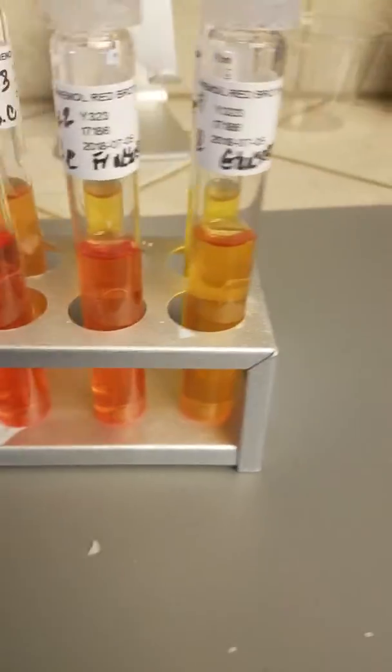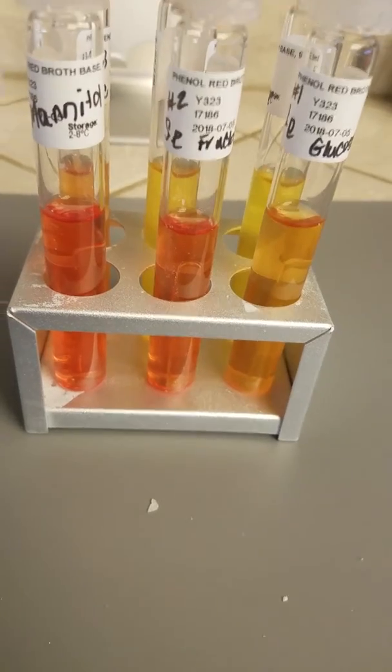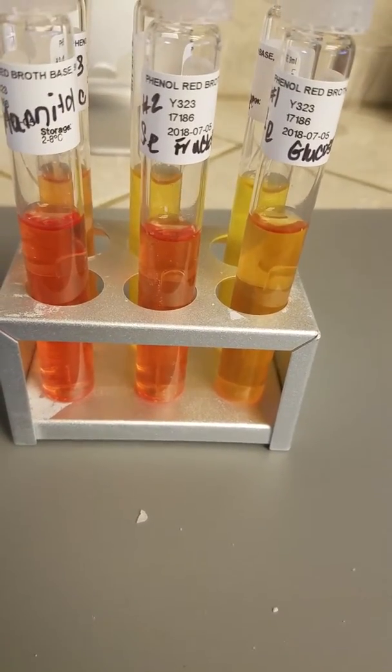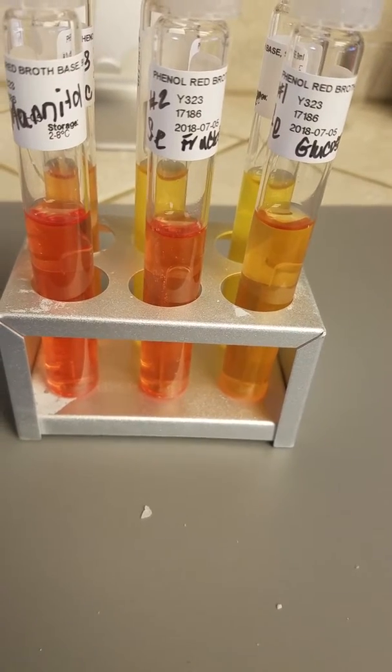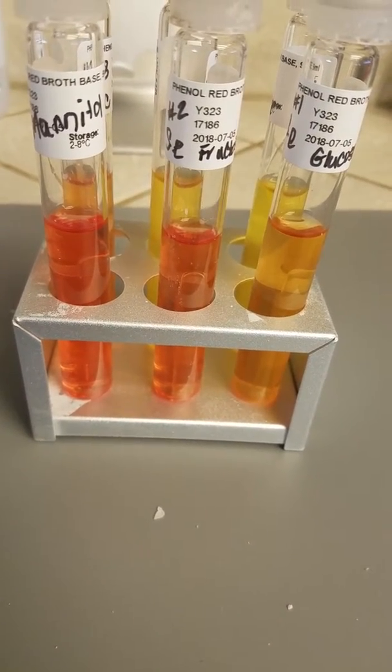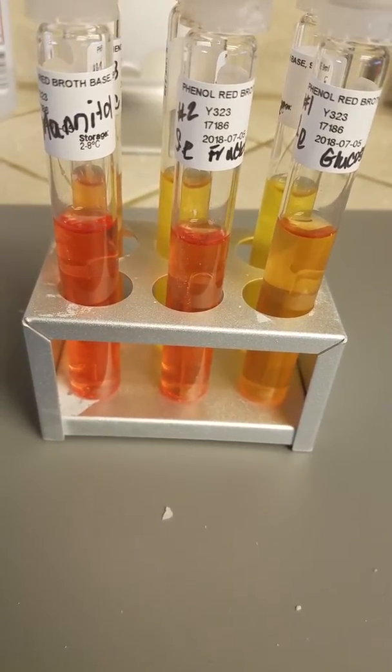But these are my results here. This is after nearly 24 hours. I started this at about 6:30 yesterday and it's now about 5 o'clock. So it's working on close to 24 hours.